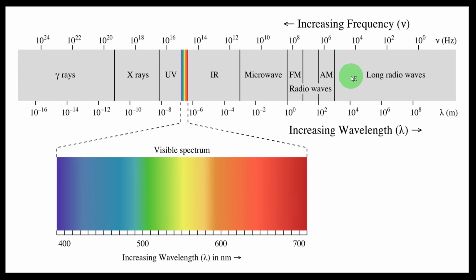Out of this power, we can sense only the visible spectrum through our eyes. In some cases, gemstones will absorb some colors inside here. We are going to measure that absorption. After absorption, we can see the black line. So we are moving to the next topic.